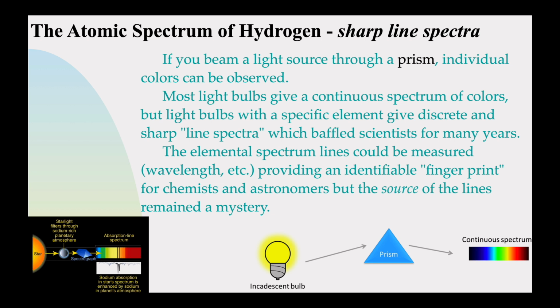These sharp line spectra are critical for astronomers because astronomers can't even get to our sun, and they can measure the composition of different things by looking at the sharp line spectra for things that are a long ways away. So it allows you to analyze the composition of things without actually having it in front of you, which is a really, really neat thing. Of course, we're not astronomers, we're chemists. We're going to look at it from different perspectives, but hopefully you can see the utility.